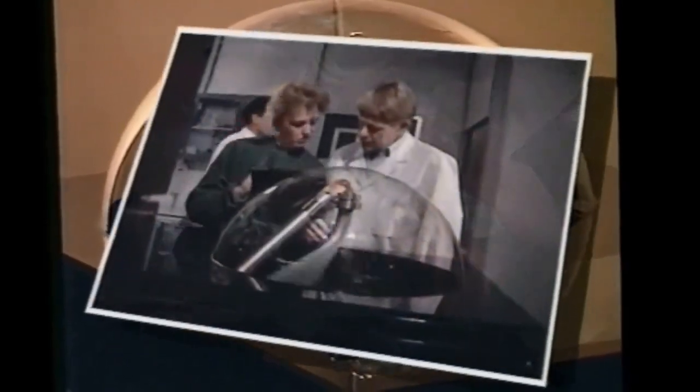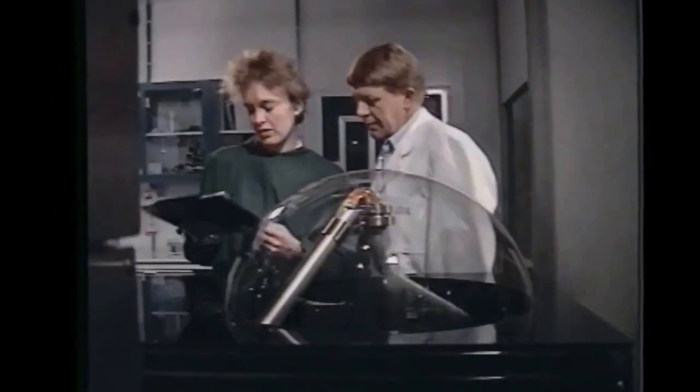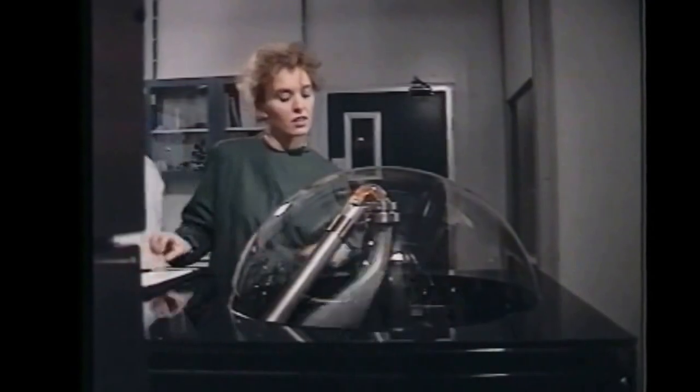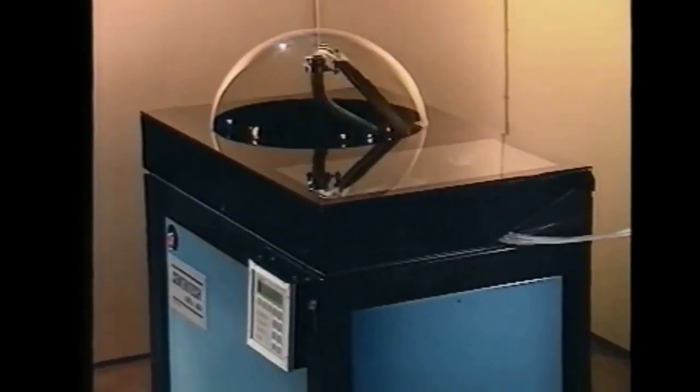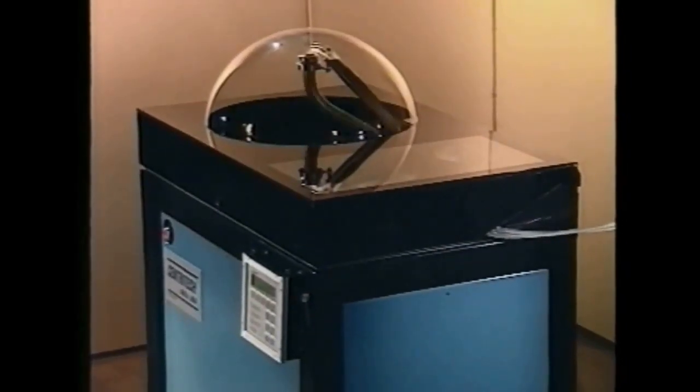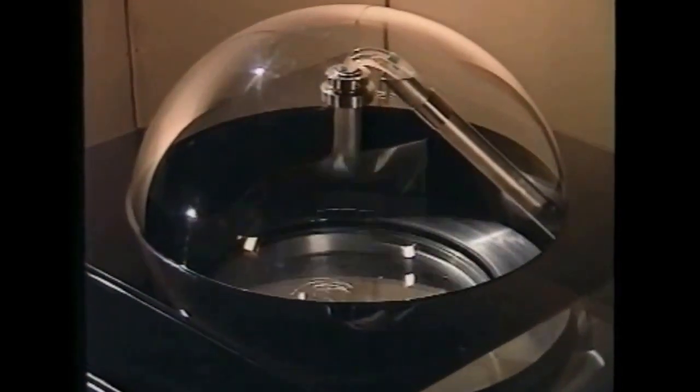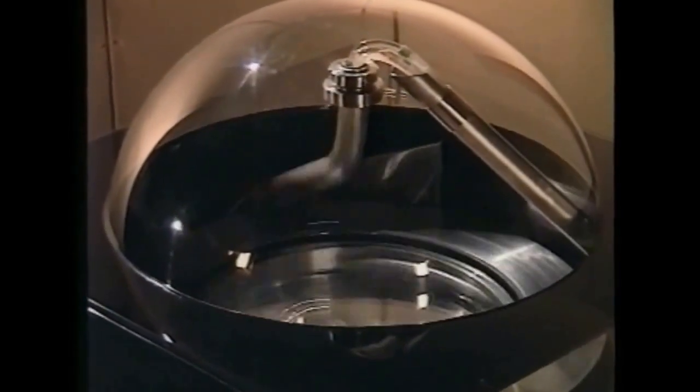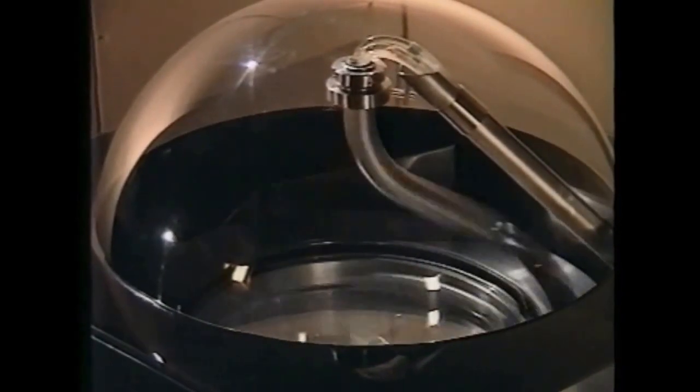Modern biotechnology is one of the most demanding environments that mankind has encountered. Centritech have produced the Centritech cell system to meet these demands and to provide the support needed now and in the future. Centritech cell is the revolutionary solution to cell separation.